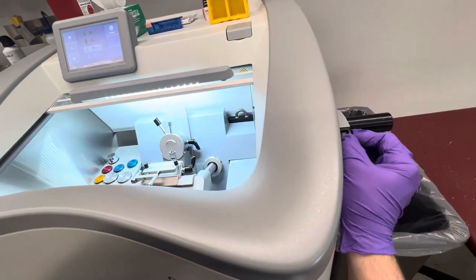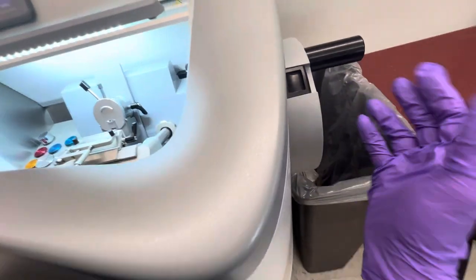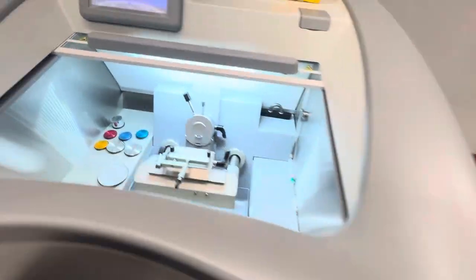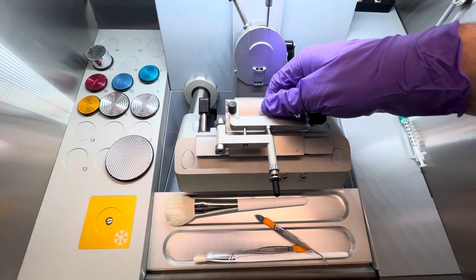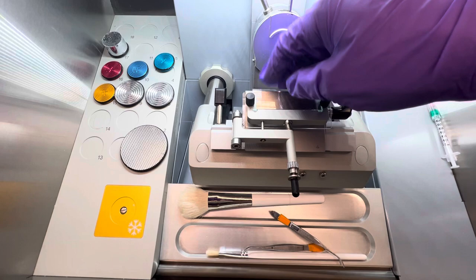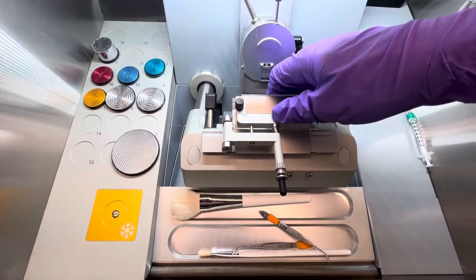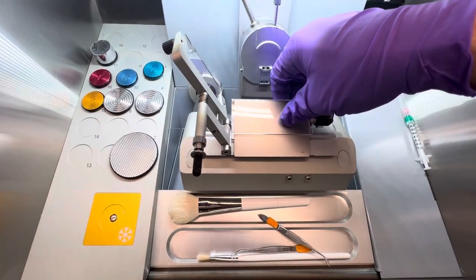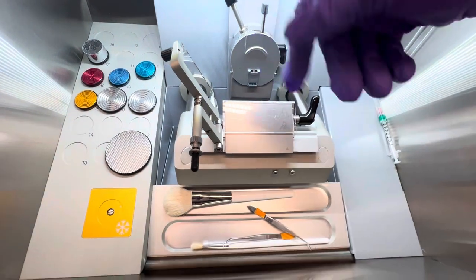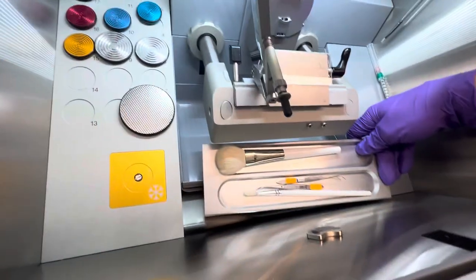So anytime you're stopping, like say you're taking a piece of tissue out, always put the safety clamp on. In this case, there's an arrow to indicate it. It might be a bit different on your cryostat, I'm not sure, but there will always be a safety clamp. Always have that on whenever you're reaching your hand in. Most times you'll be busy, so you don't have to put this on every time, but if you're walking away from the cryostat, definitely have the blade cover on. However, if you're reaching in, just bear in mind to be very careful, because you can, again, slice your hand open.